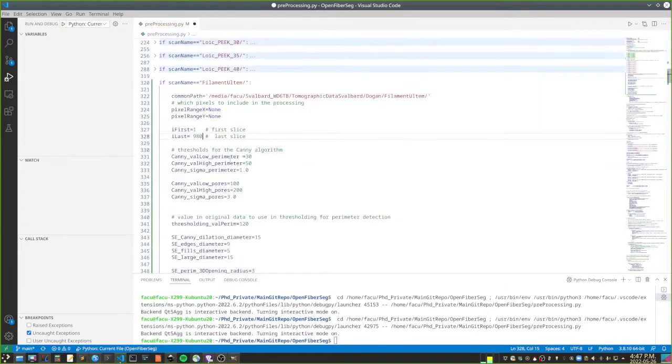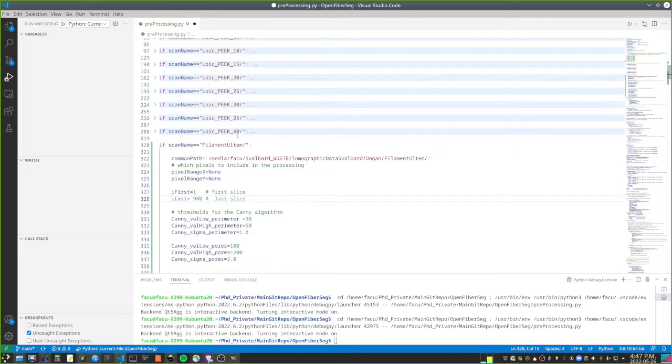But also, when we're looking for parameters, we can't plot everything, because it's going to run through an entire function, say the histogram equalization, for instance, and it has to run through the entire list of slices. So if there's 900, it's going to make 900 figures. That doesn't work. So for this stage where we're finding parameters, I usually look for somewhere in the middle. It's not really important that it be exactly in the middle, and I leave like 4 or 5. In this case, let's try with 4.